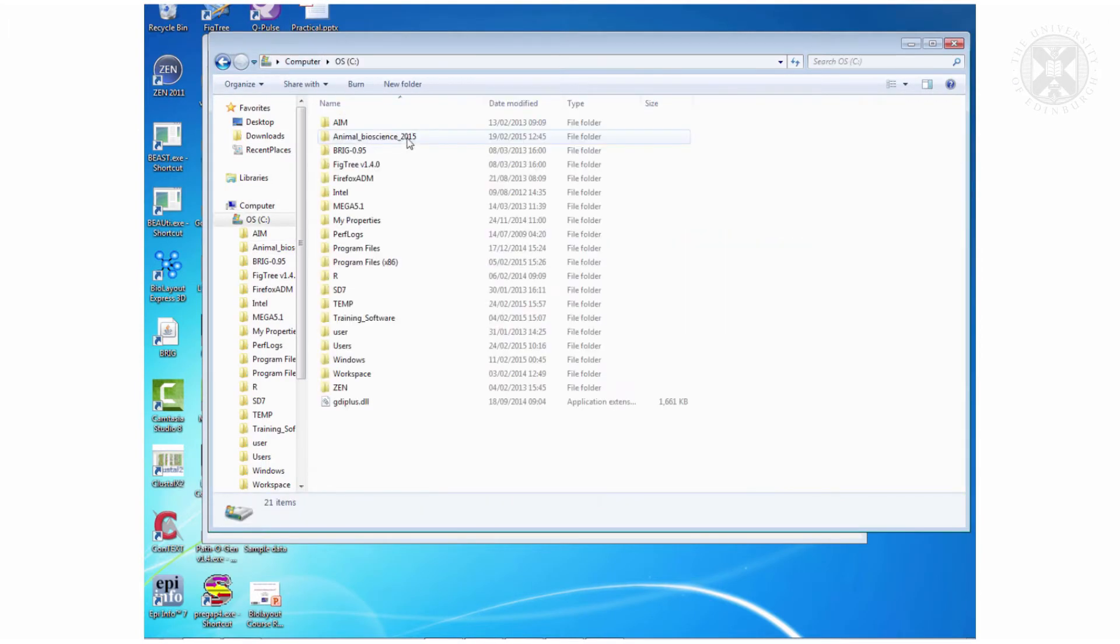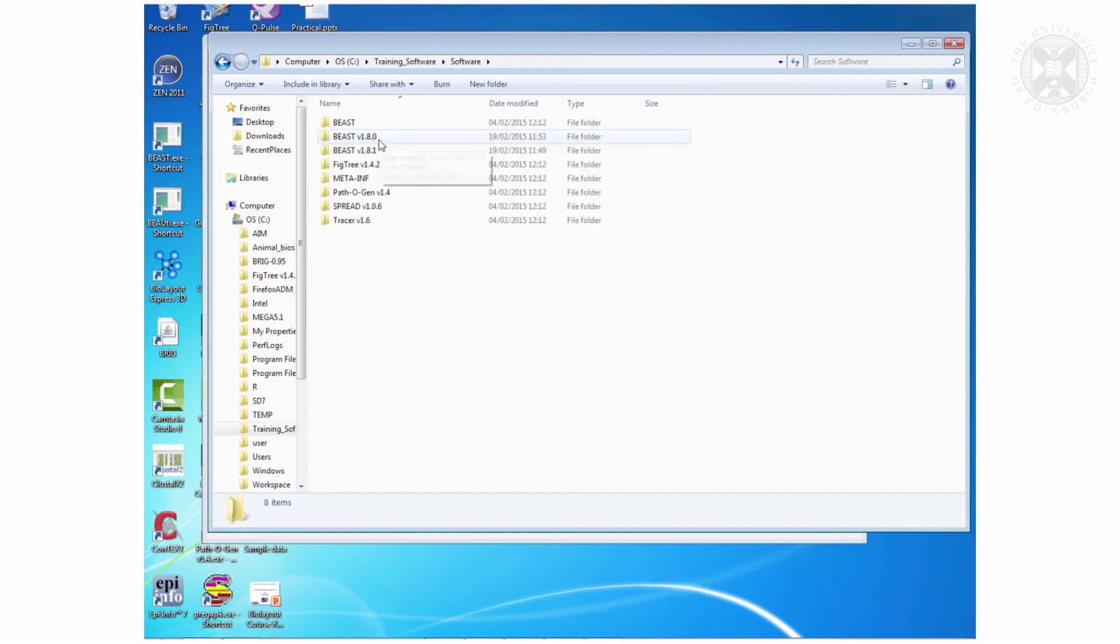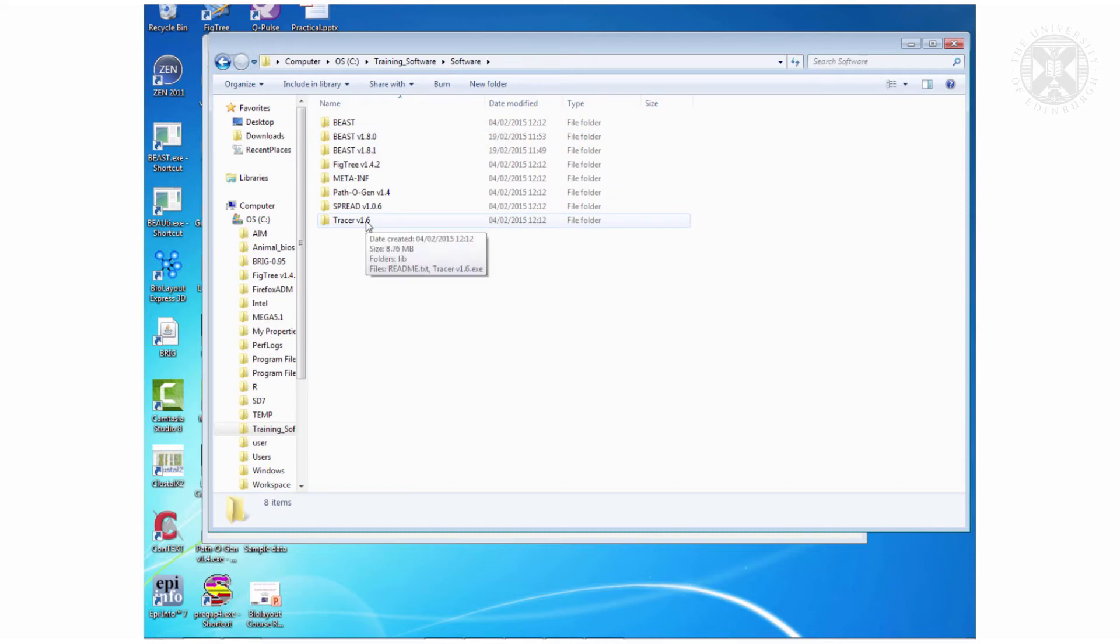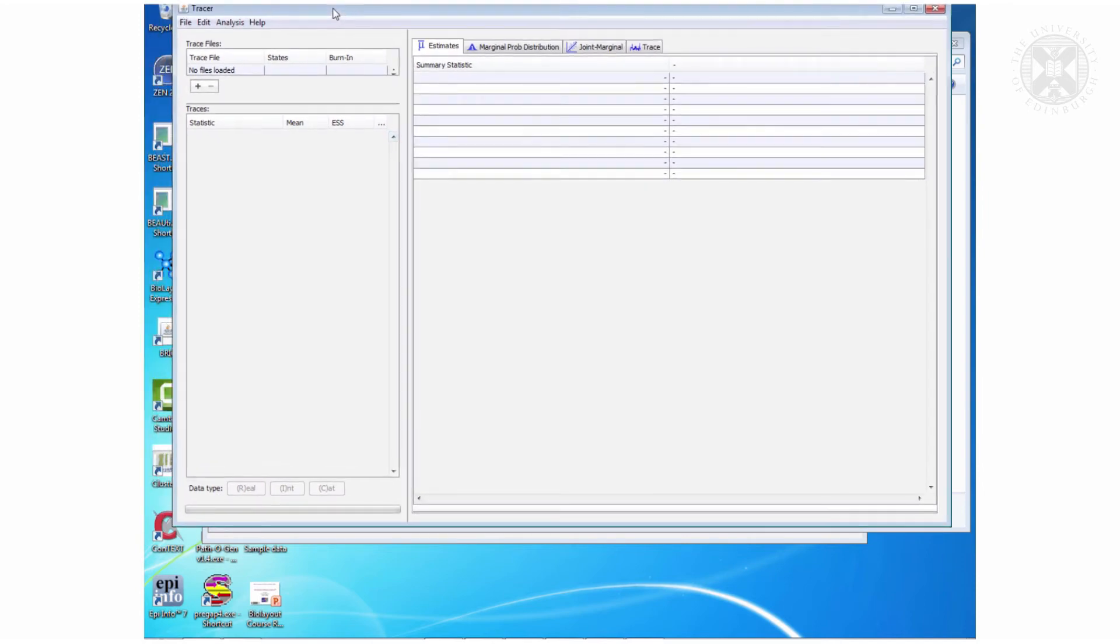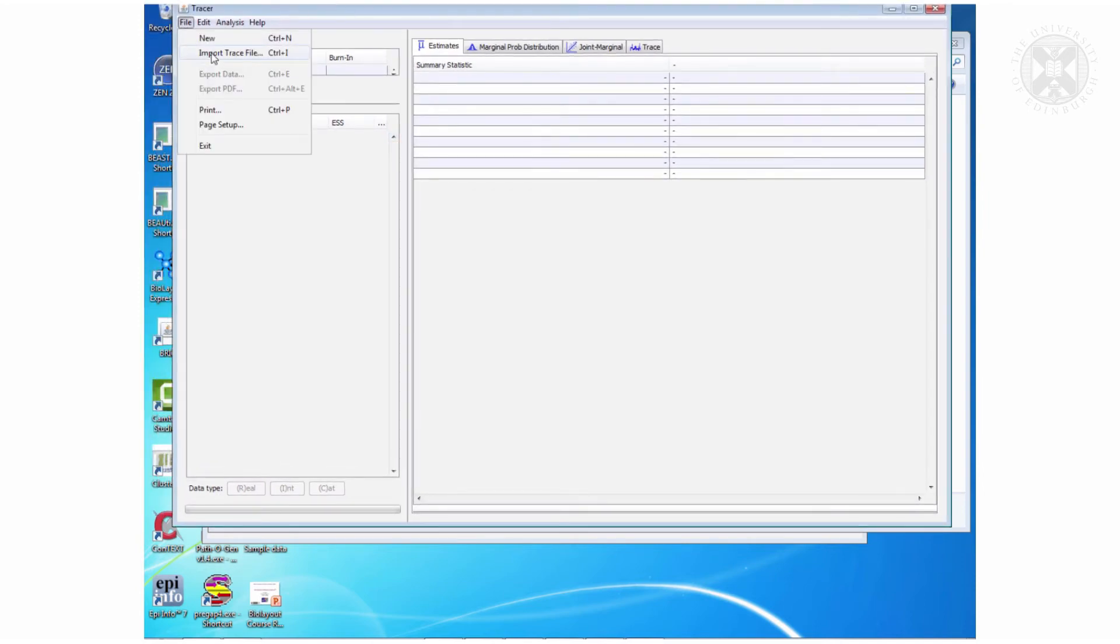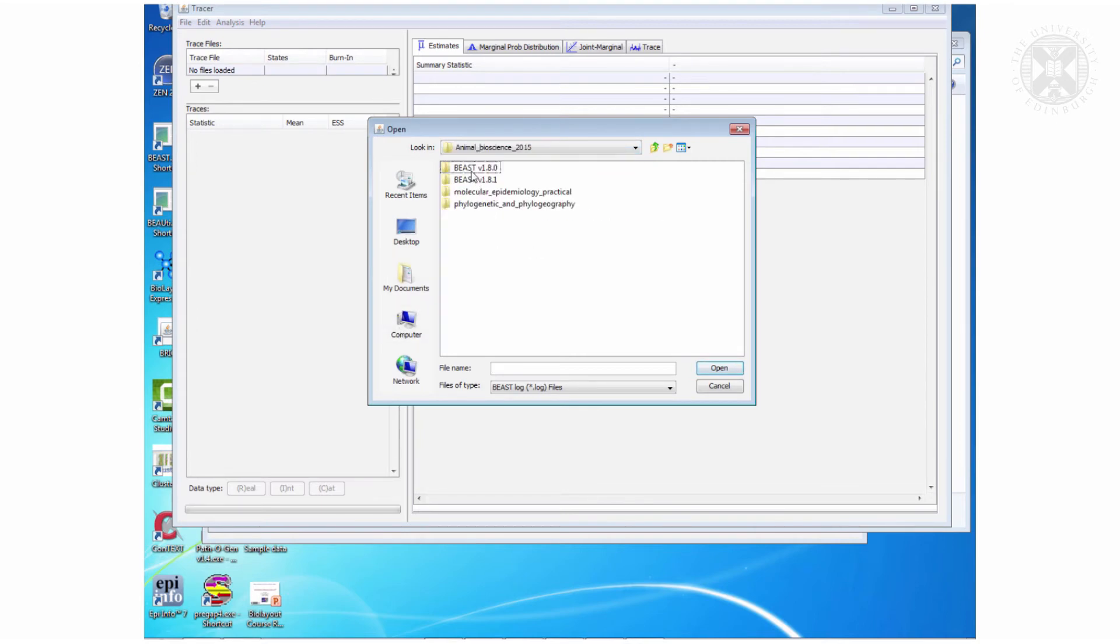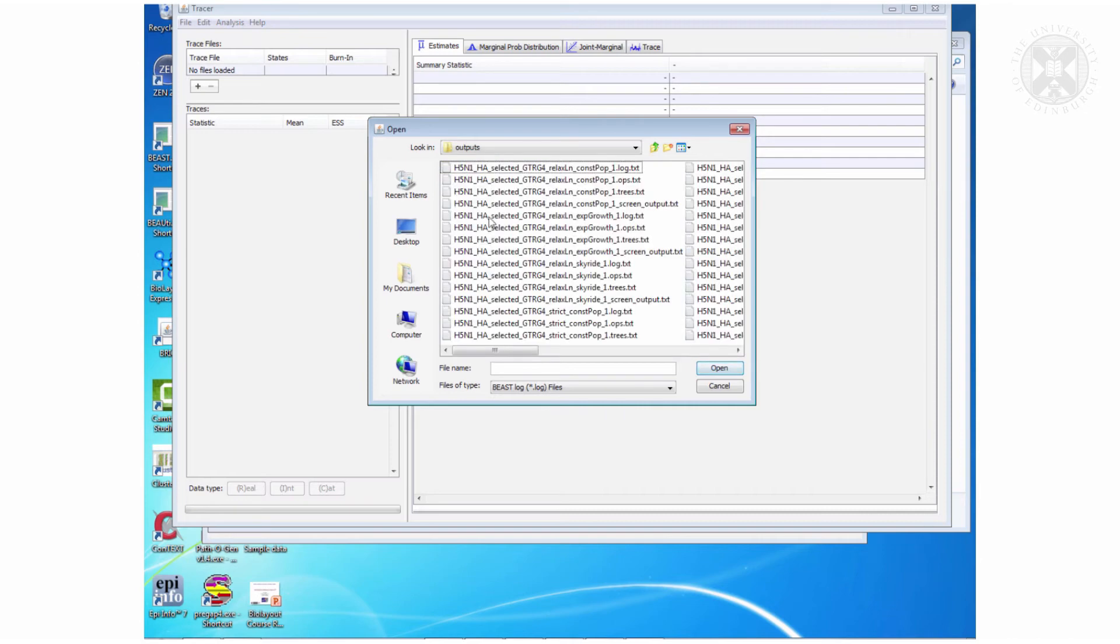Tracer is again in that training software programs file in software. So this is Tracer and this will let you load in those log files. So import a trace file into Tracer, opening those ones I've made earlier in runs for practical, plain ones, outputs. Let's just try this one first of all.